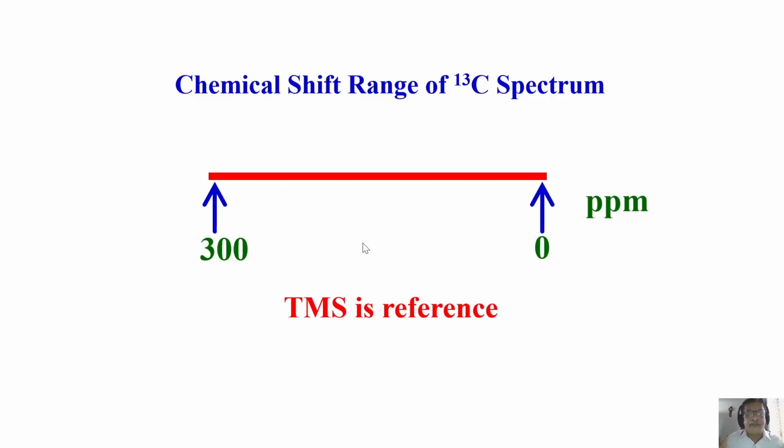That's all my range of observation. That is the width of the spectrum I want to see, called spectral width. If I have to see carbon 13 in the same 500 megahertz, it is 125 megahertz for the carbon. Now 125 into 3, 125 into 3, it is 37,500. It becomes huge.